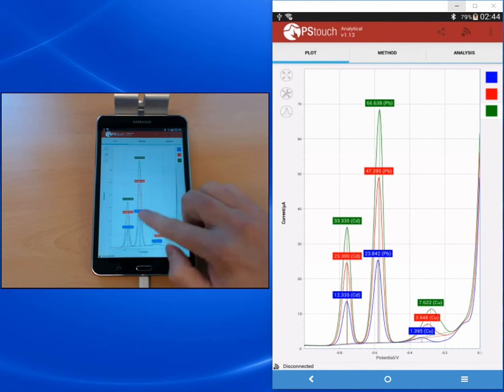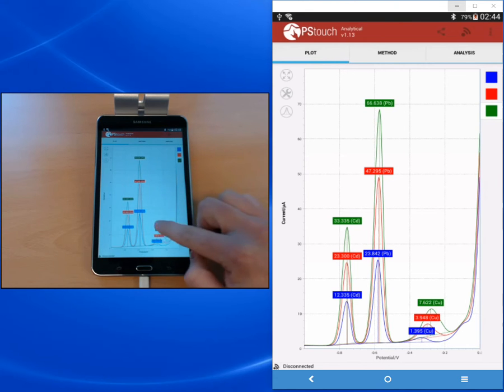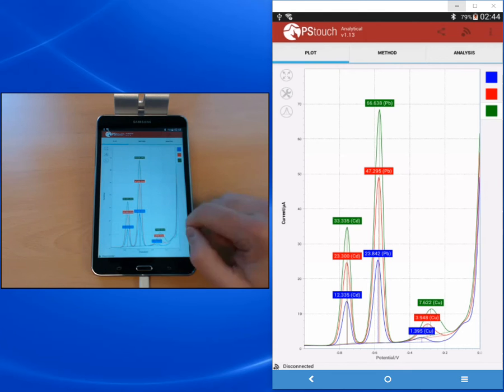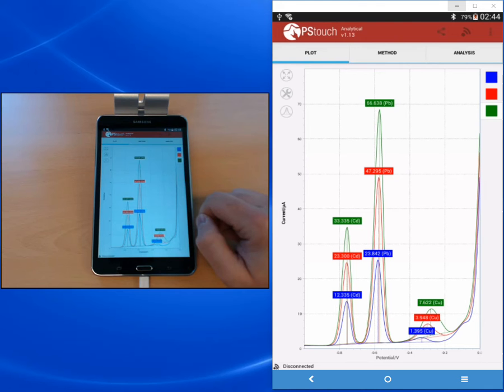The auto detection already found the peaks so they're all labeled, and you see that the labels actually indicate which analytes belong to that peak. How we add these labels I will show later.